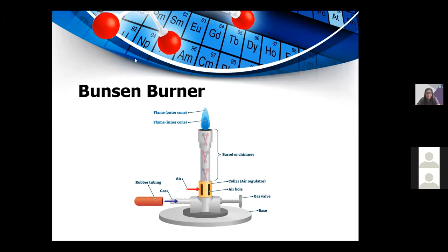To visualize the Bunsen burner — this is the Bunsen burner. At the bottom, near the base, is the gas valve that allows the flow of gas to light the burner. The air valve, or collar, surrounds the barrel of the burner and allows the flow of air to completely combust the gas.